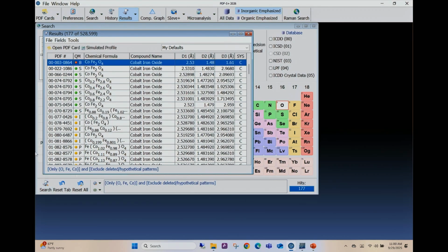All right, just a couple things. So right now I've got the data here. And when it shows up, it will show up in order of PDF entry numbers. So it's the 00 data first, then 01, 3, 5, etc. Okay.